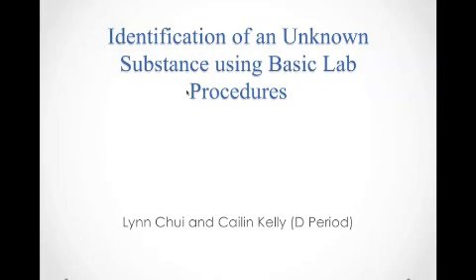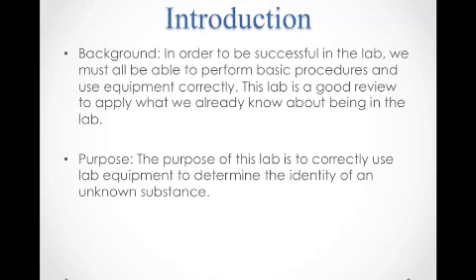In the first lab this year, its elemental lab, our task was to determine the identity of a mystery metal. And the purpose of this lab was mainly review. The concepts weren't too difficult to grasp.